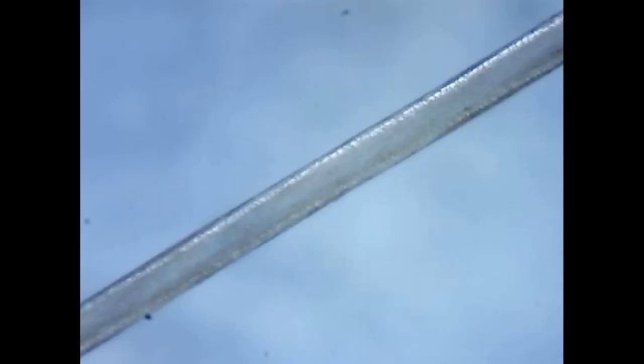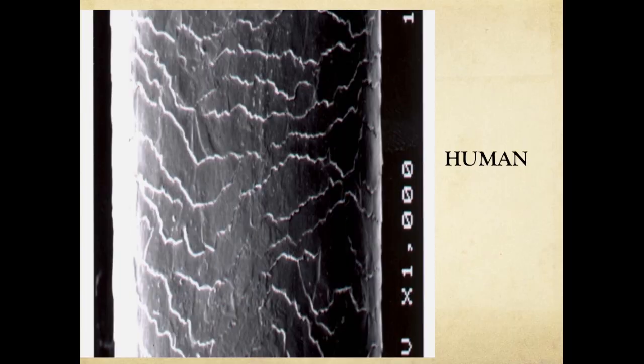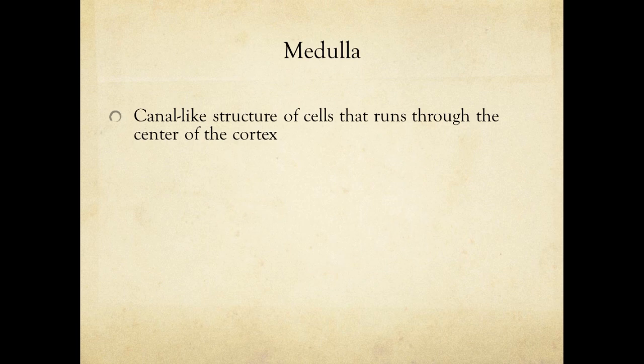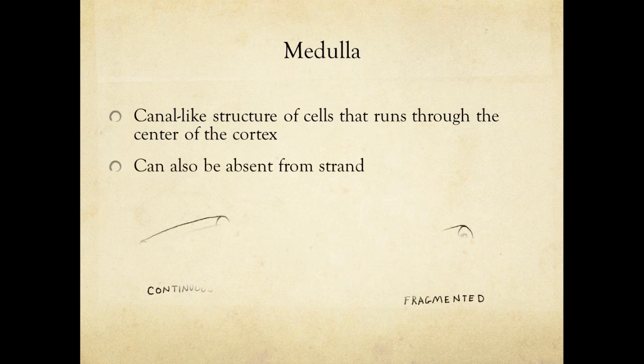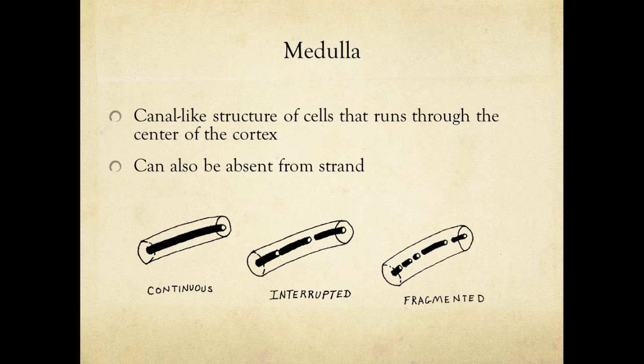This is a human hair under the ProScope microscope — you can just make out the cuticle pattern. If you put the human hair under a scanning electron microscope, the imbricate pattern comes out very clearly. One other major structural feature visible in hairs is the medulla, a canal-like structure that runs through the center of hairs. The medulla can take different patterns and thicknesses, and it can even be absent altogether. This feature is never present in plant fibers or synthetic fibers, so if you see a medulla, you immediately know it's a hair.